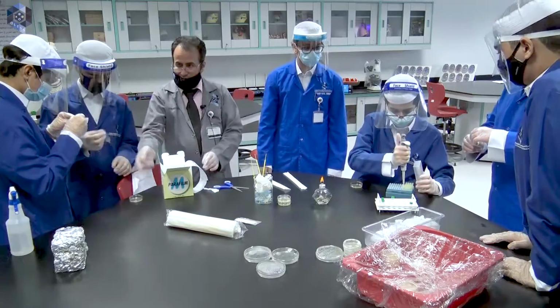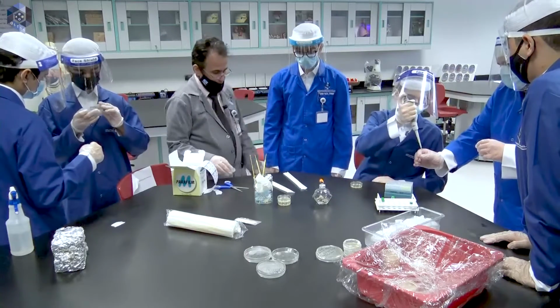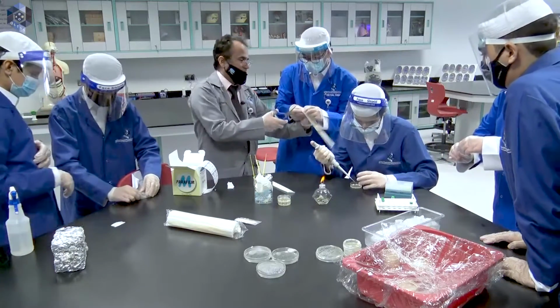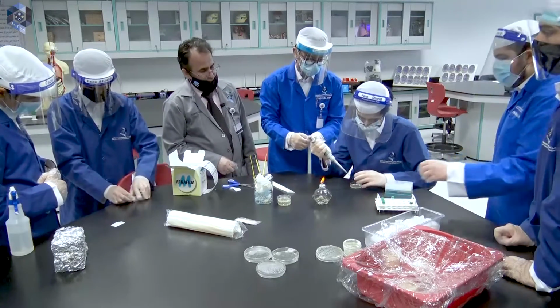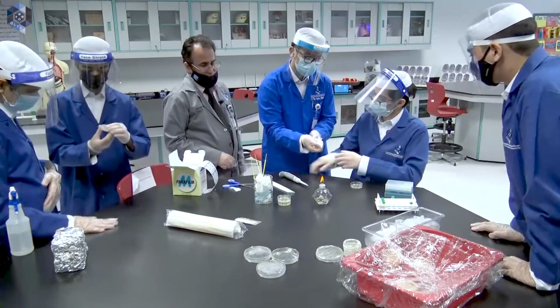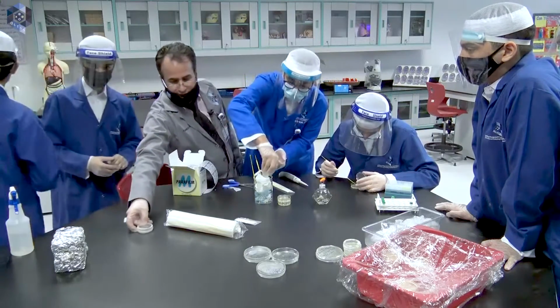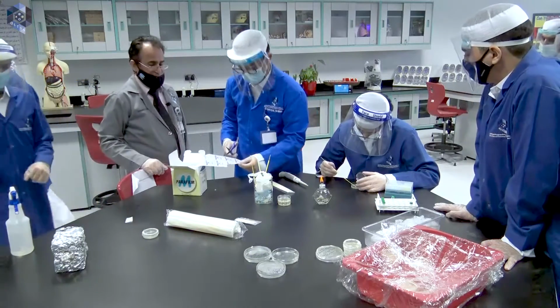Take this, now wrap it around. Don't tilt it. Leave it like this. Leave it for some time to settle, then we will move it to the incubator.